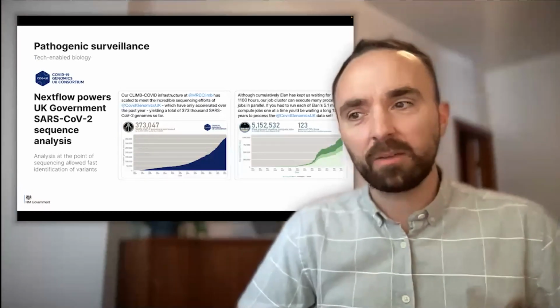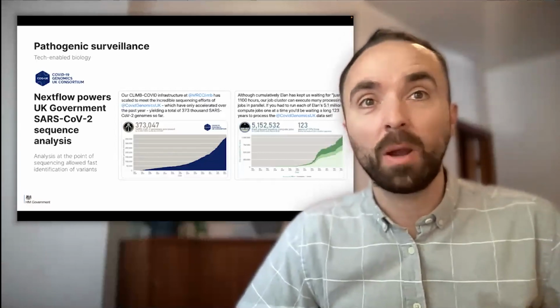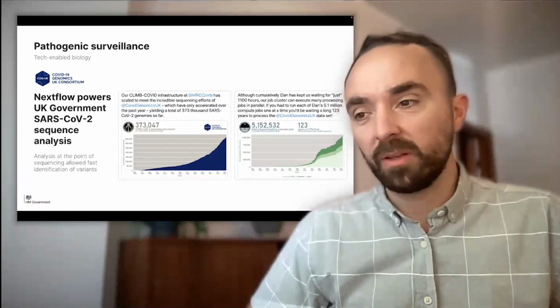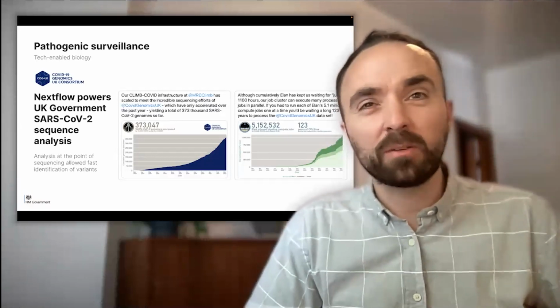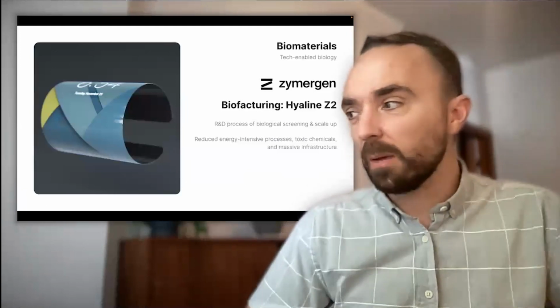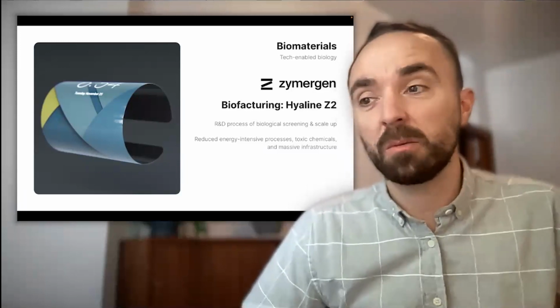The portability of Nextflow workflows allowed them to quickly move the analysis close to the point of sequencing, away from in-house HPC towards close to where the sequencing is actually being done. It was incredible to see how fast this move was performed and how it facilitated really quick turnarounds and time to first result.